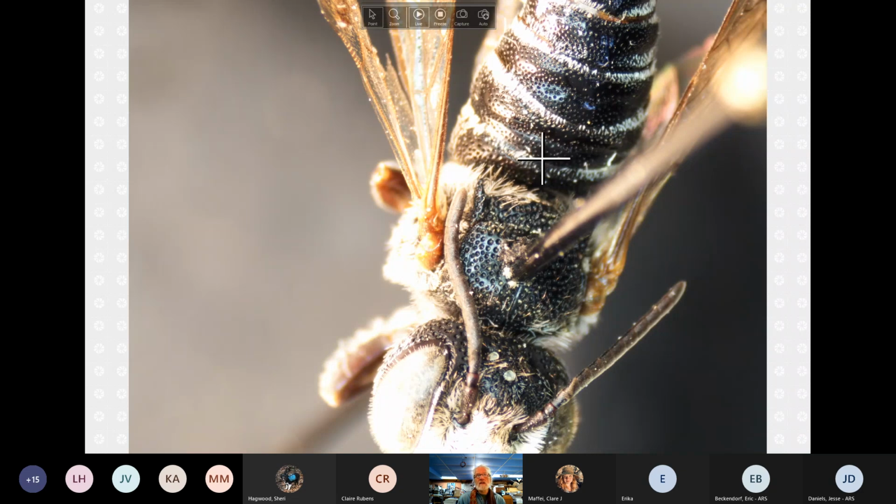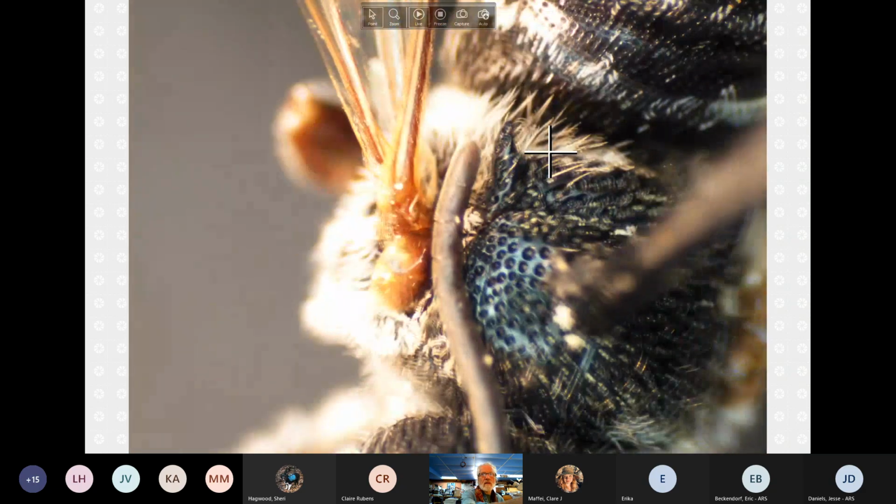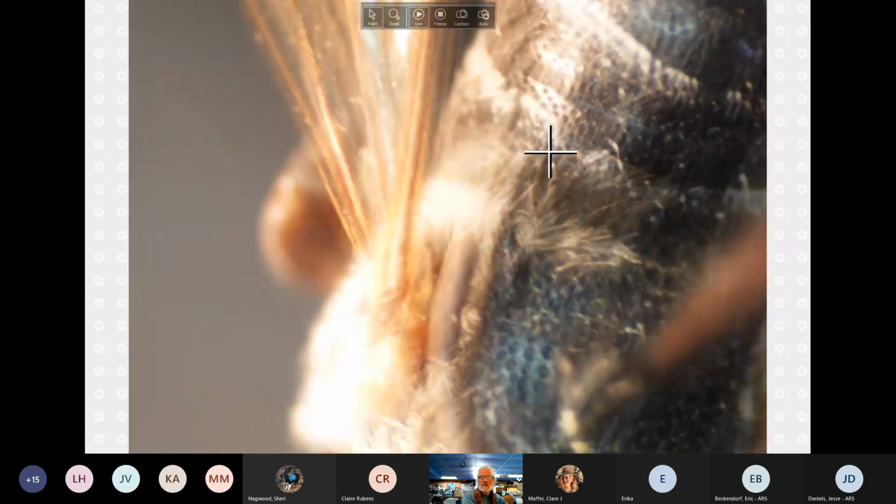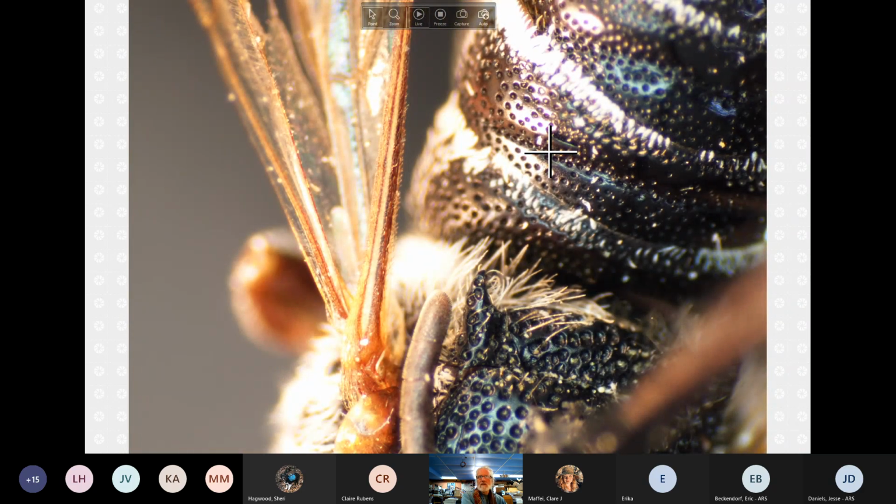Okay, here's T1. Here's the groove through T2, and I was incorrect in saying it was anterior. It's posterior to the groove. And here you can see pretty well the fovea. So it's oblong in that case, and you can't see any pits. Let's zoom in. And I need to shift it a little bit. There's the lovely axilla sticking out, projecting quite far.